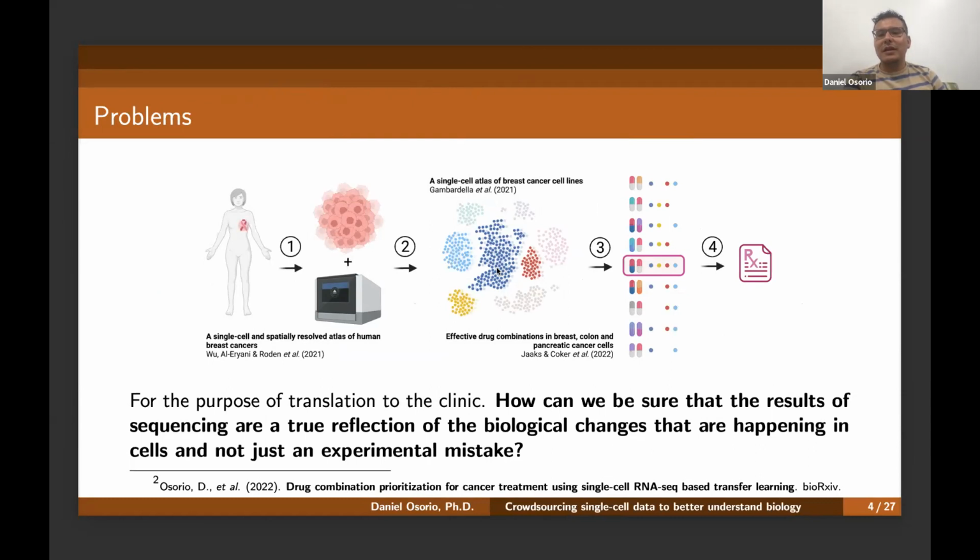So what we did was first cross-validate the mapping function using different technologies to map the cells to the original atlas of cell lines. We took MCF7 from a different lab using a different technique and mapped them back into the atlas to see if the batch effect could be removed and the identification could be correct. We found that it is accurate with 90% precision.